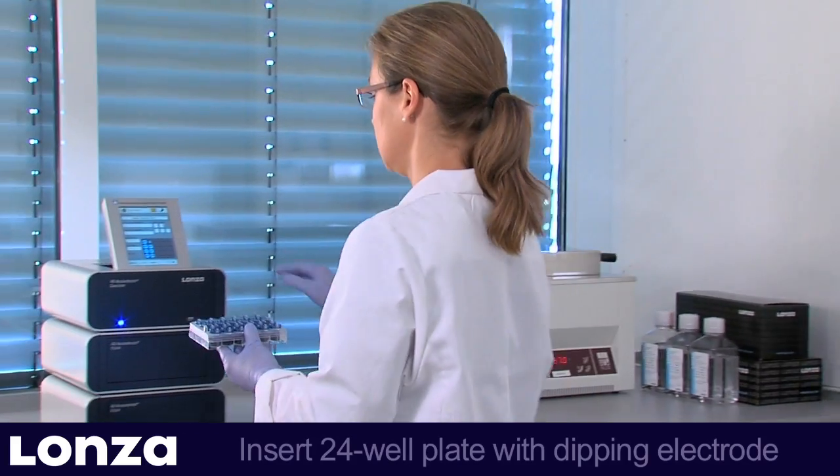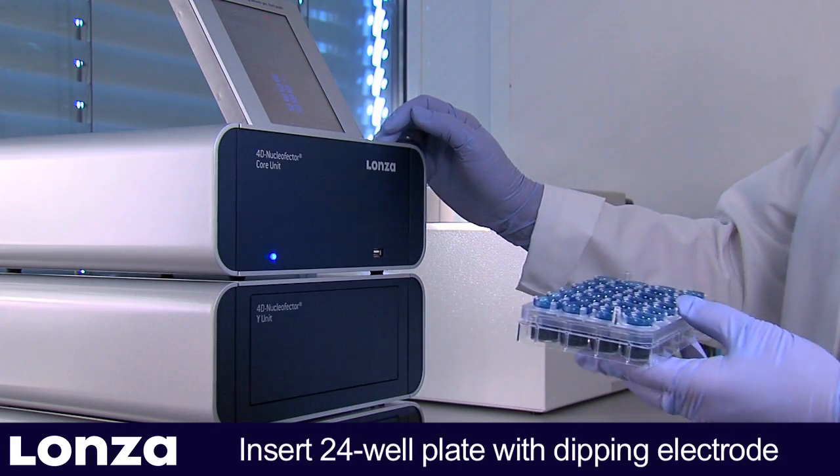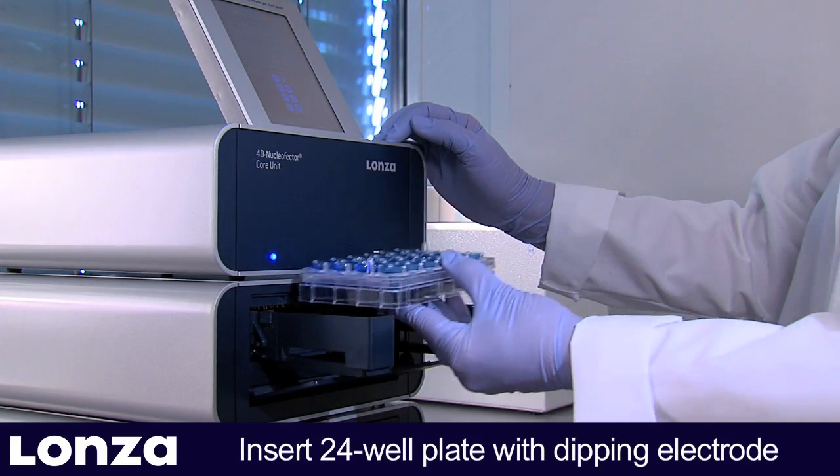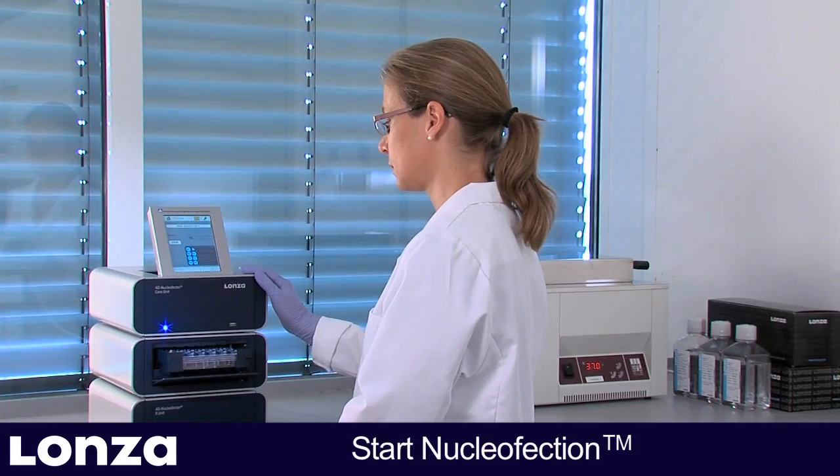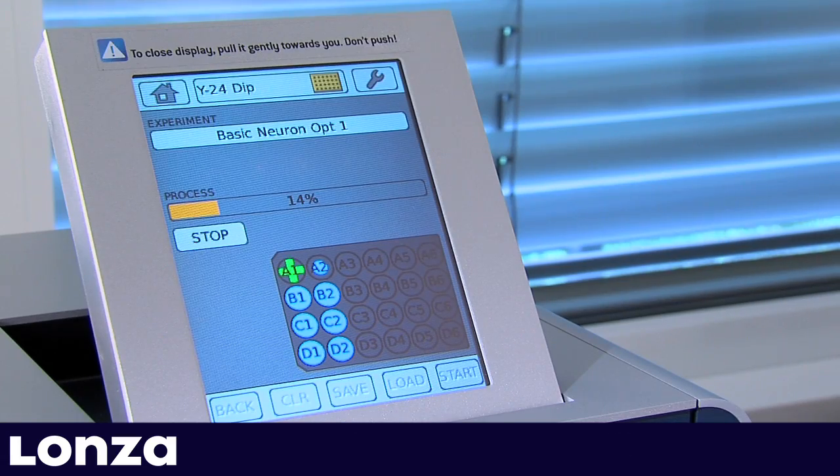Place the 24-well plate with the dipping electrode into the 4D Nucleaffector Y-Unit. The predefined experiment is started by pressing OK on the touch screen. Each well is now processed individually.